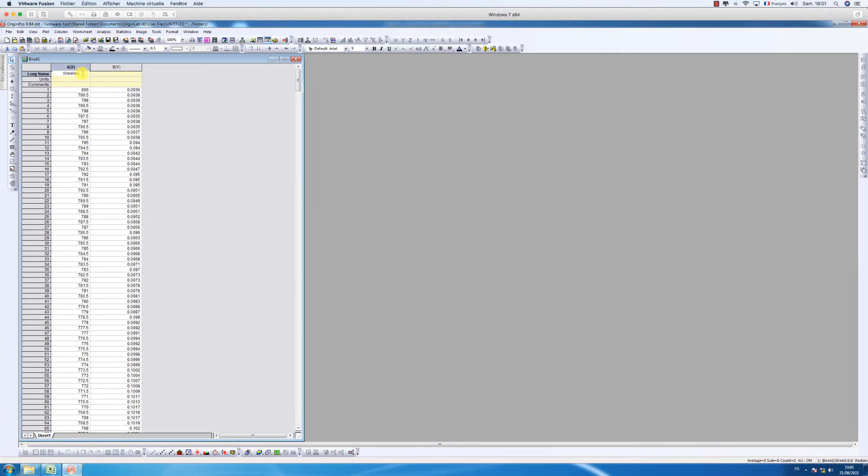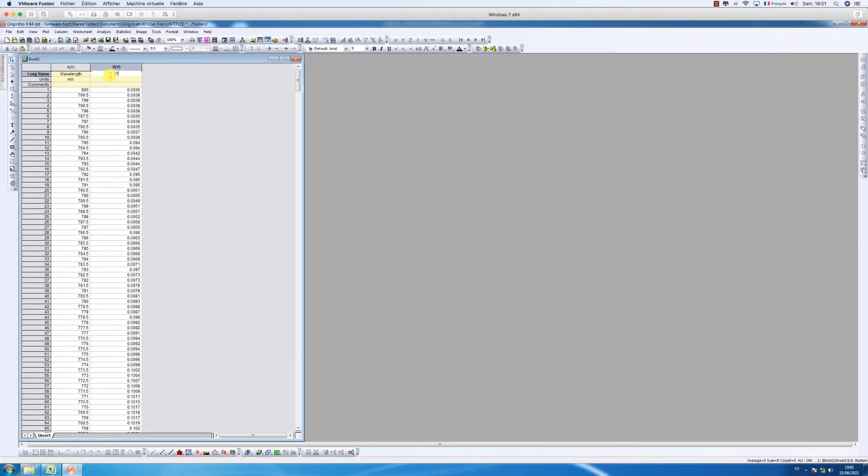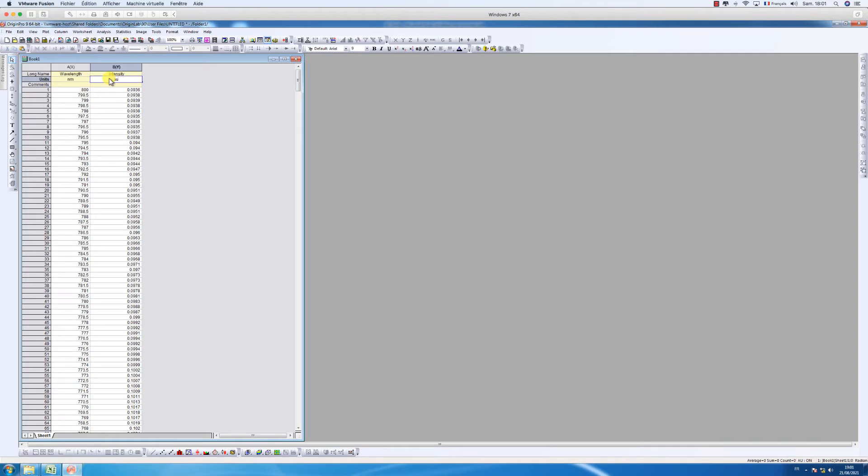In this video we're going to learn how to plot UV visible spectra using ORIGIN software. First of all, as you can see from the screen, you have to copy your data on ORIGIN. As you can see, the x and y axis.